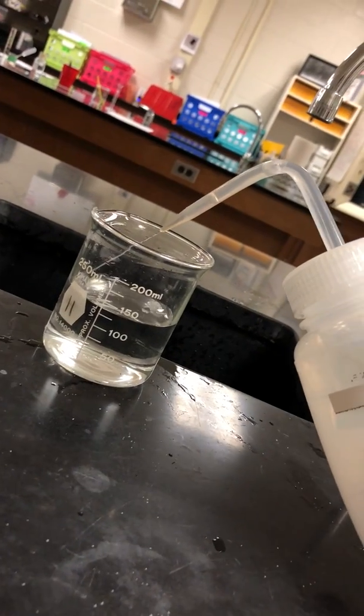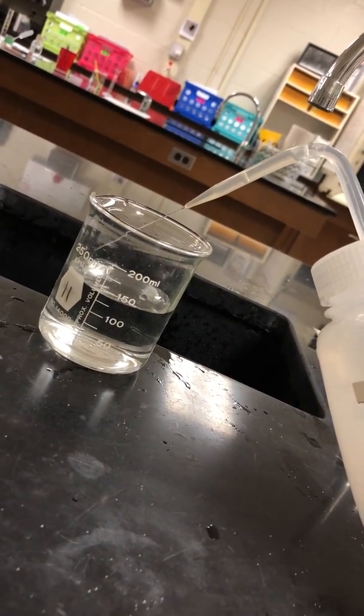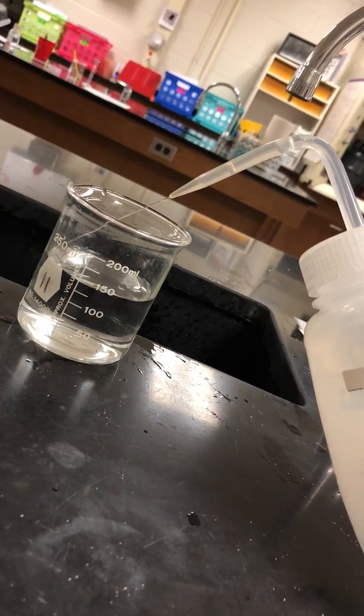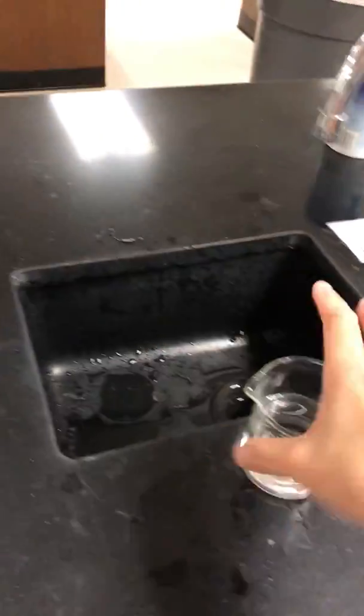Been doing it all day, and it is still fun. So yeah, I'm using the wash bottle to get the rest of my water. Says approximate, I'm good. Cool.